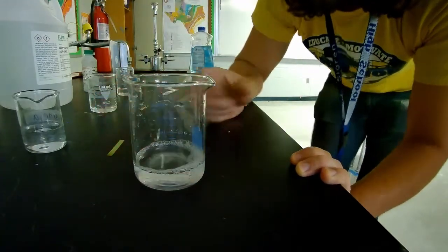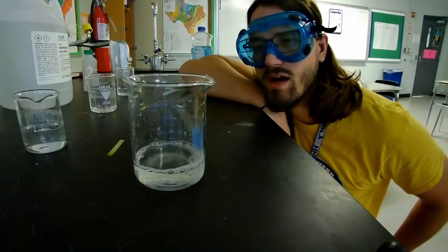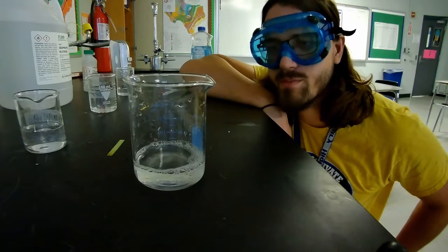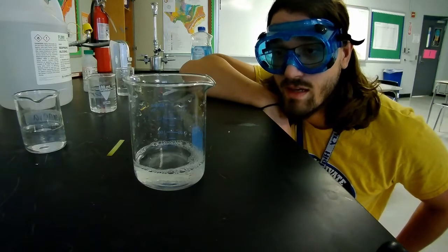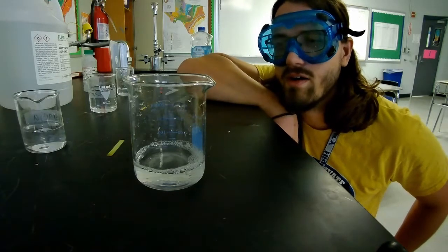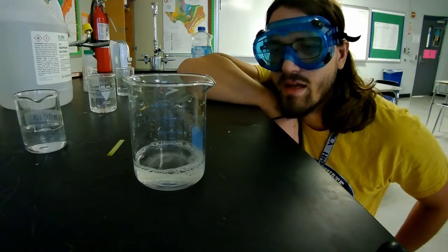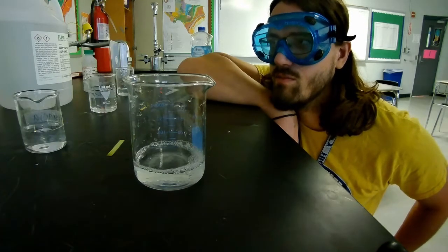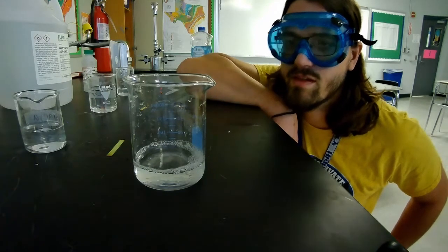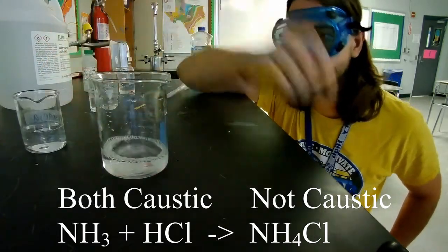No smell anymore. So what happened is that really strong smelling compound of ammonia was completely neutralized, and the atoms rearranged themselves into new molecules, and the new molecule, which is ammonium chloride, is basically just a type of salt. So what we managed to do here is create a bit of salty water. And the caustic nature of ammonia and hydrochloric acid, both of which burn your nose if you smell them, is basically completely neutralized. I can put my nose right in this and smell it, and it doesn't smell like anything.